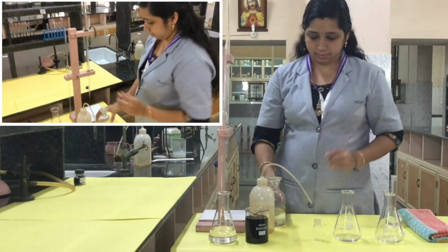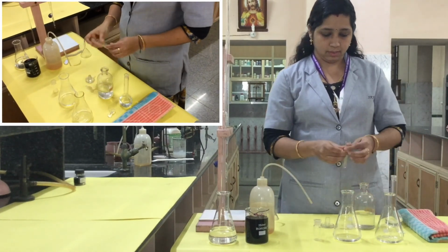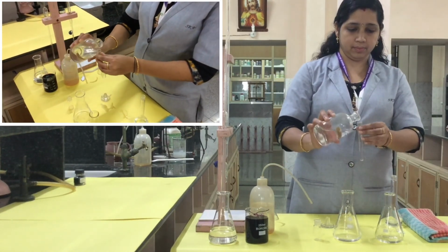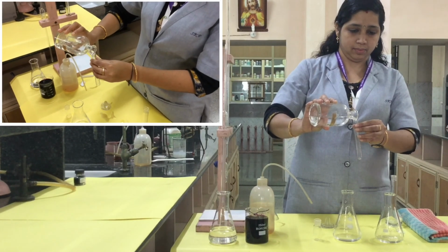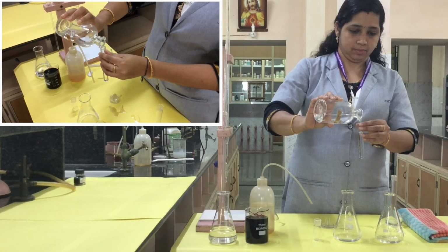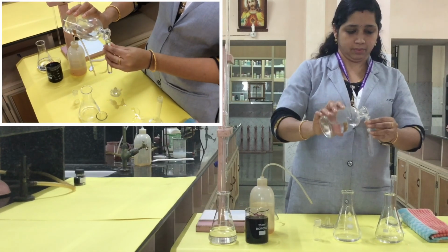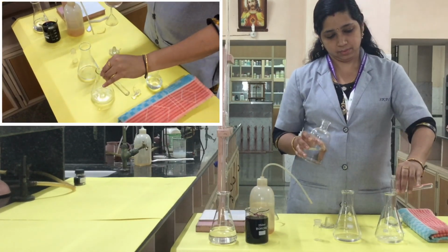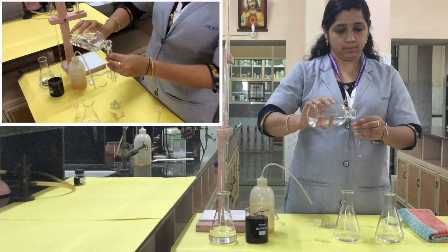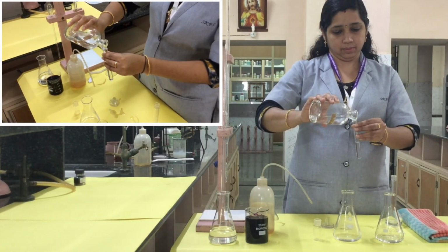Now for carrying out the titration, we want to add dilute sulfuric acid to the Mohr salt solution taken in the conical flask. Again, 1 test tube full of dilute sulfuric acid we'll have to add to this conical flask. We are adding this sulfuric acid 2 times. First we added it while making the standard solution. Then after pipetting out, before the titration, you will have to add 1 test tube of sulfuric acid into the conical flask also.